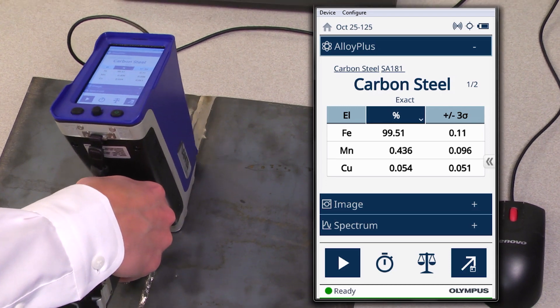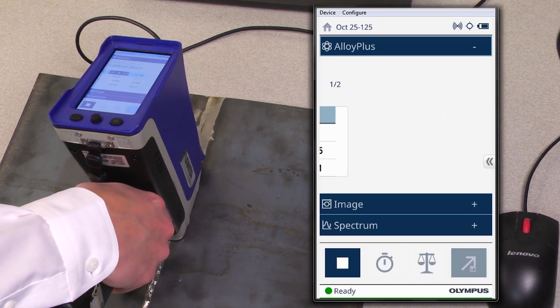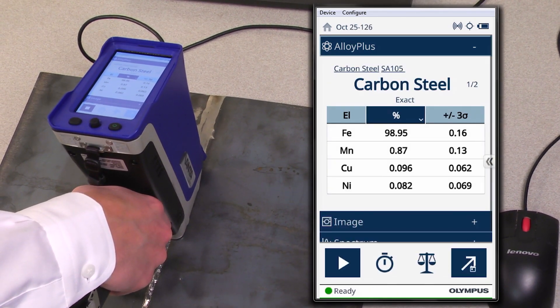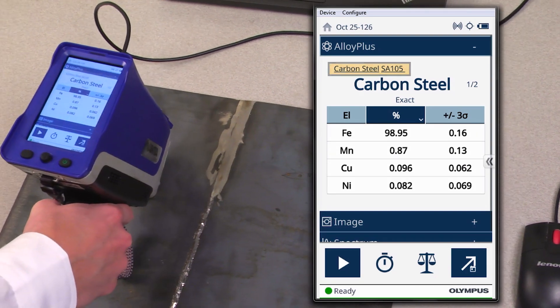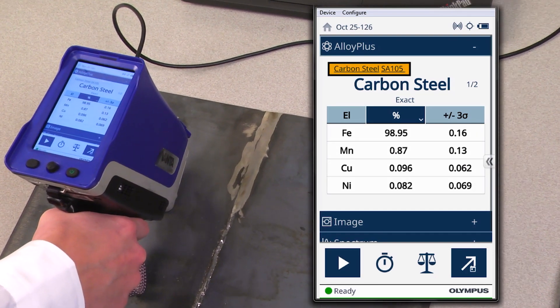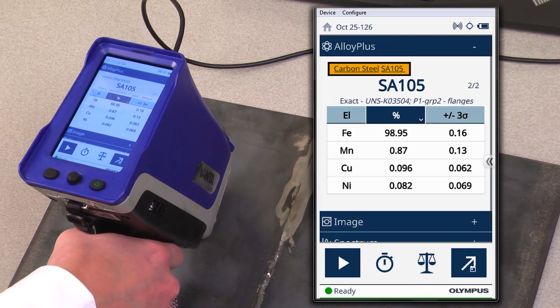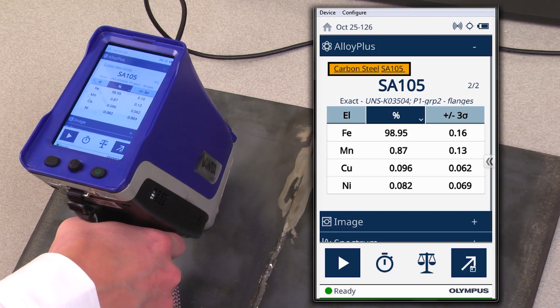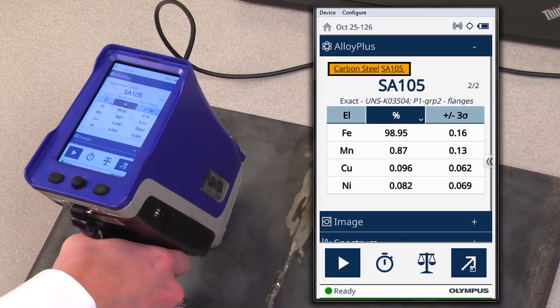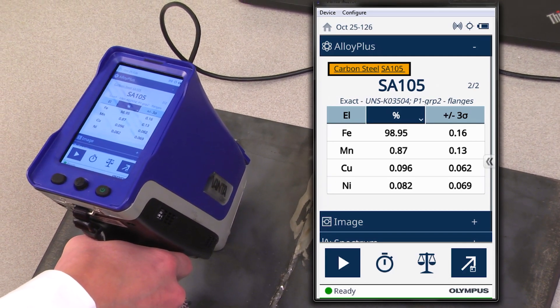And then finally, analysis of the weld. After analysis of the weld, there are two grades displayed at the top of the screen: both the carbon steel as well as the welding grade of SA-105. The analyzer realizes that there's a manganese difference from the base material to the weld material, and then accounts for it by displaying both grades at the top of the screen.